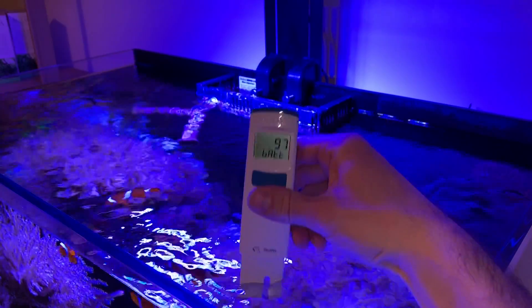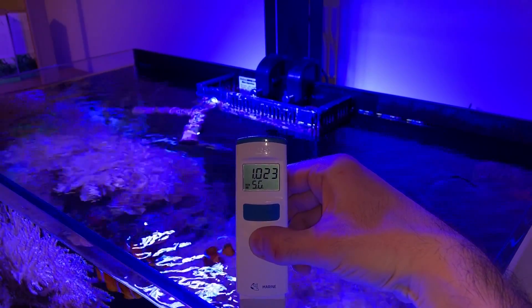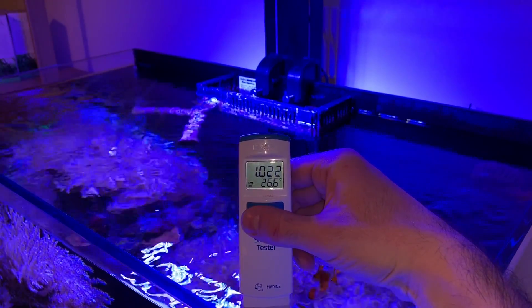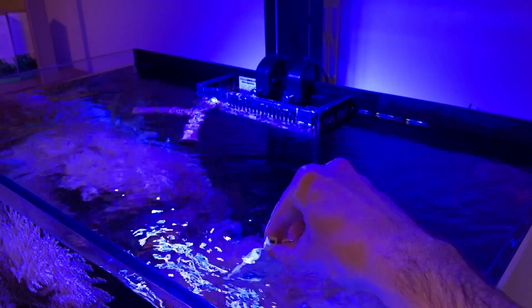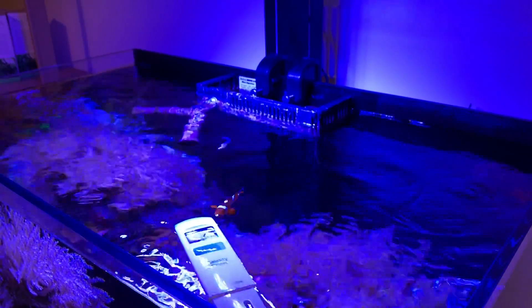Actual testing couldn't be easier. Simply press the power button on the unit and place the probes in the water you want to test. The unit will automatically display the salinity and temperature on the screen. The checker being aware of the temperature means you'll get a really accurate reading. As mentioned, the unit is fully waterproof and if dropped in the aquarium it will float.